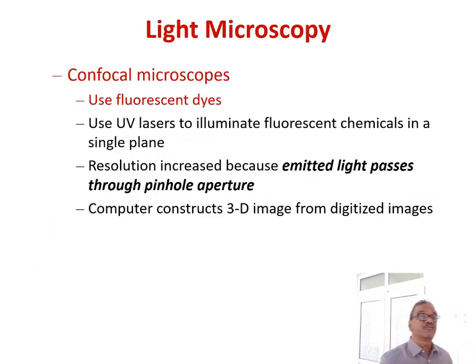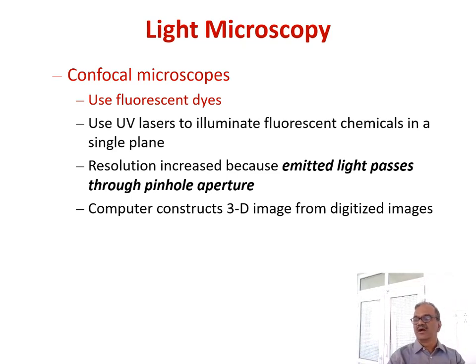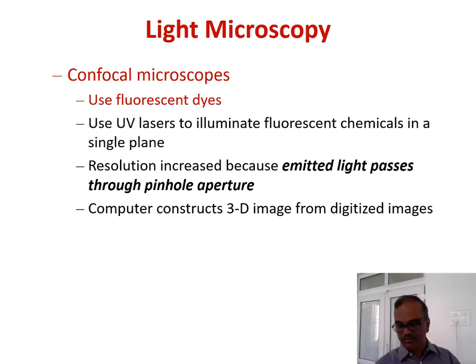Okay. Then confocal microscope. In the light microscopy itself, confocal microscope. So here also the fluorescent dyes are used, but the resolution is increased using UV lasers, because the emitted light passes through a very minute pinhole aperture, so that the image is visualized or constructed as a 3D image, and then digitized images you can get in case of confocal microscope.